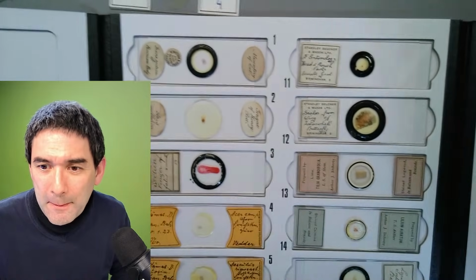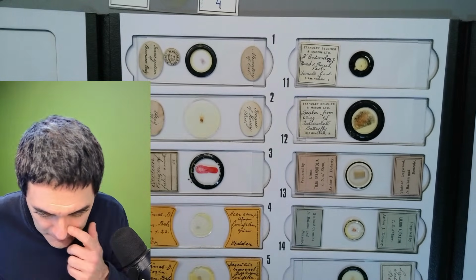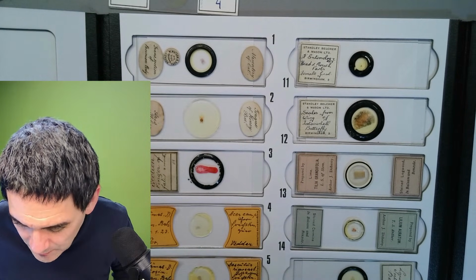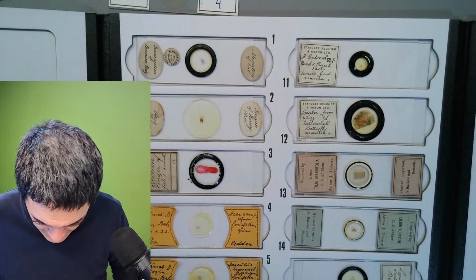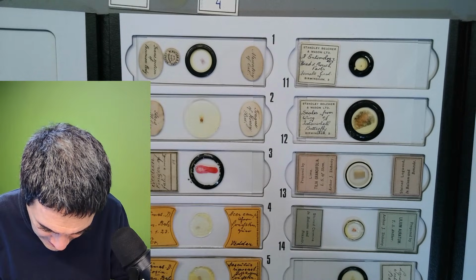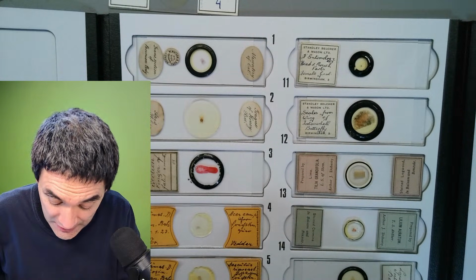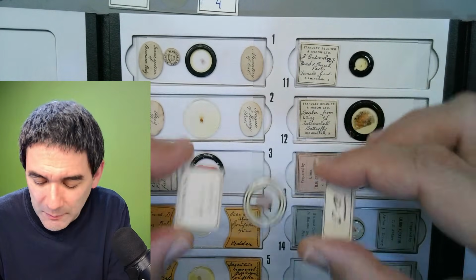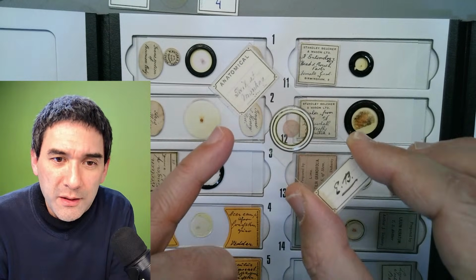So I got this one. I'm going to show you a couple of interesting ones now. I should probably have indexed them better. I just want to show you some slightly controversial ones. I like this one so much, and when I made a video of it, people were not so interested. But this one has a very high educational value. It's the tail of a monkey.